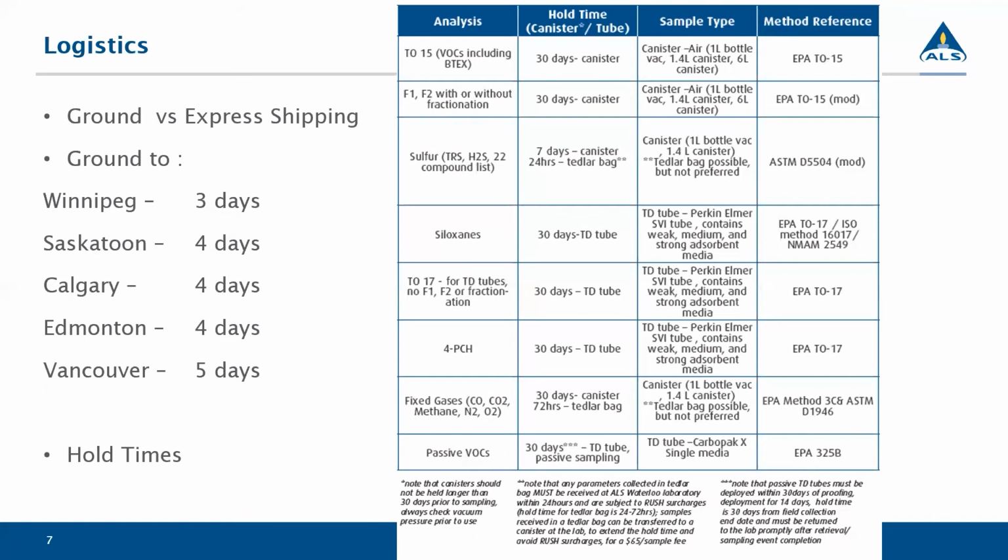For the passive thermal desorption tubes, and we will talk about those at the end, the deployment time varies depending on the use that you have for it. Generally you're not collecting for just a 12-hour time, and there's no flow controller attached if you're using passive VOCs. These are just deployed, and through passive diffusion sample is collected, but we will go over that when we get to the thermal desorption tubes.